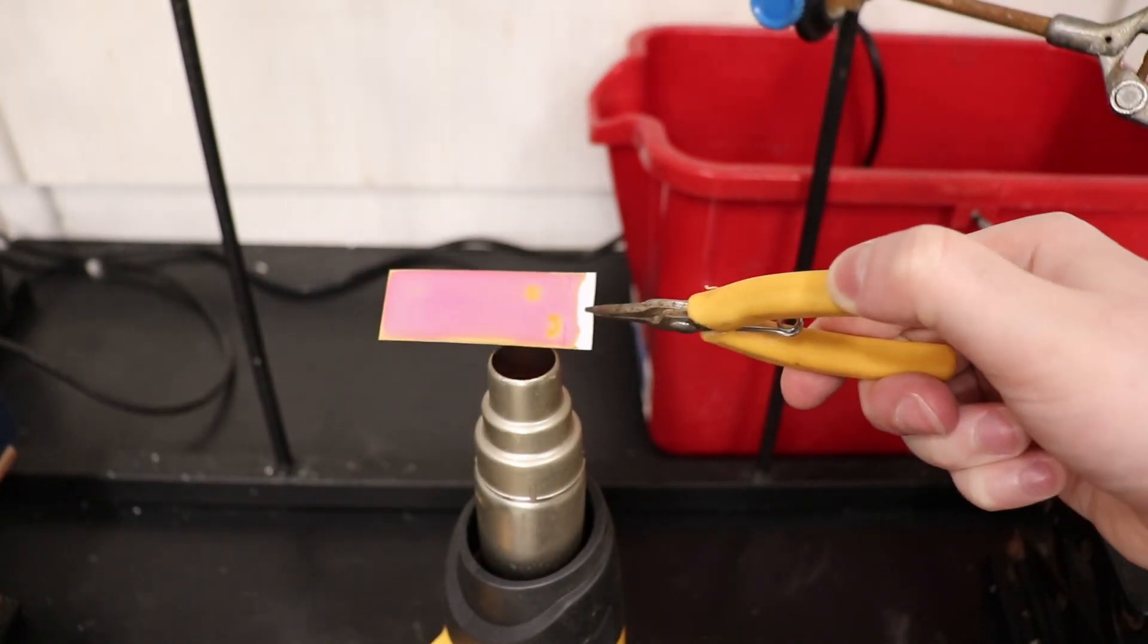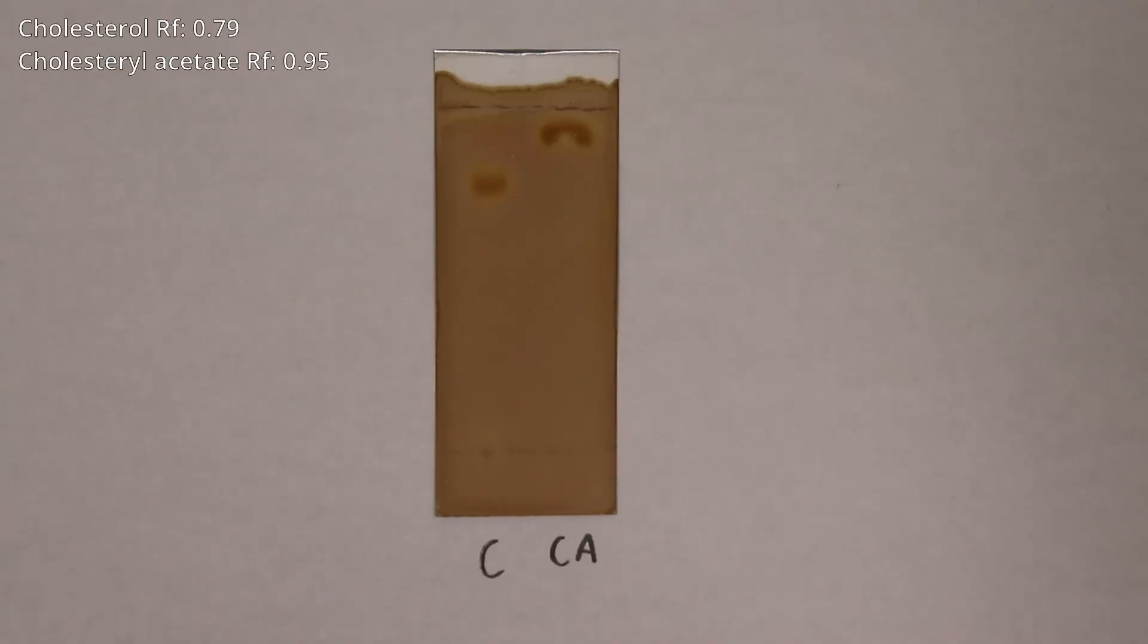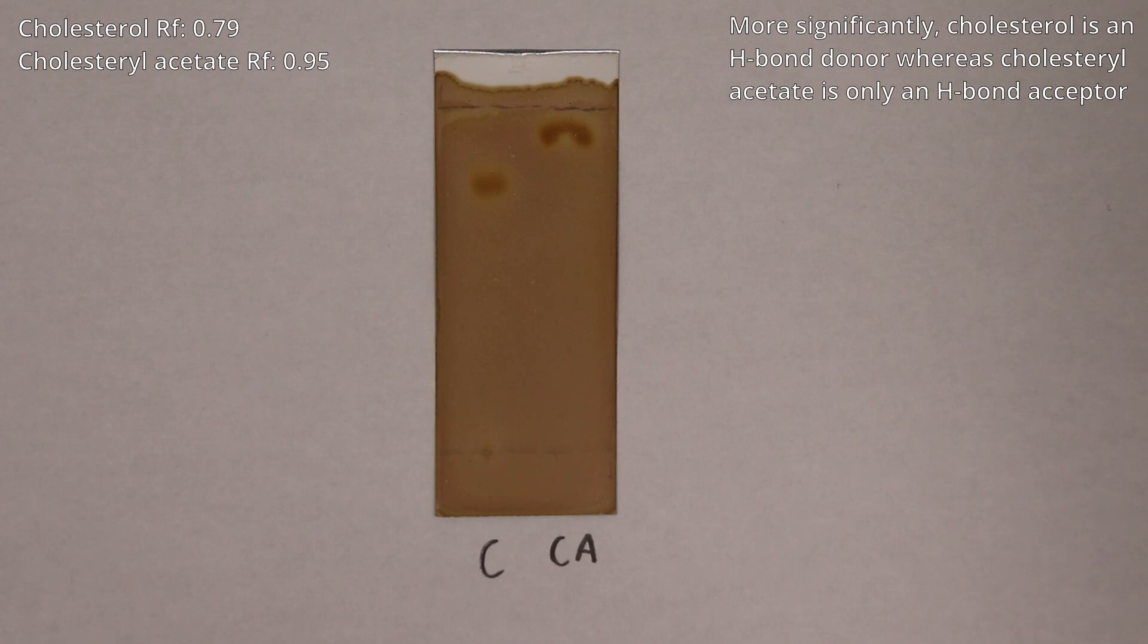You can see that the cholesterol acetate has a higher RF value than the cholesterol, which makes sense since the polar alcohol group in the cholesterol was replaced with the less polar ester group. And based on this TLC, there is no visible starting cholesterol in the product.